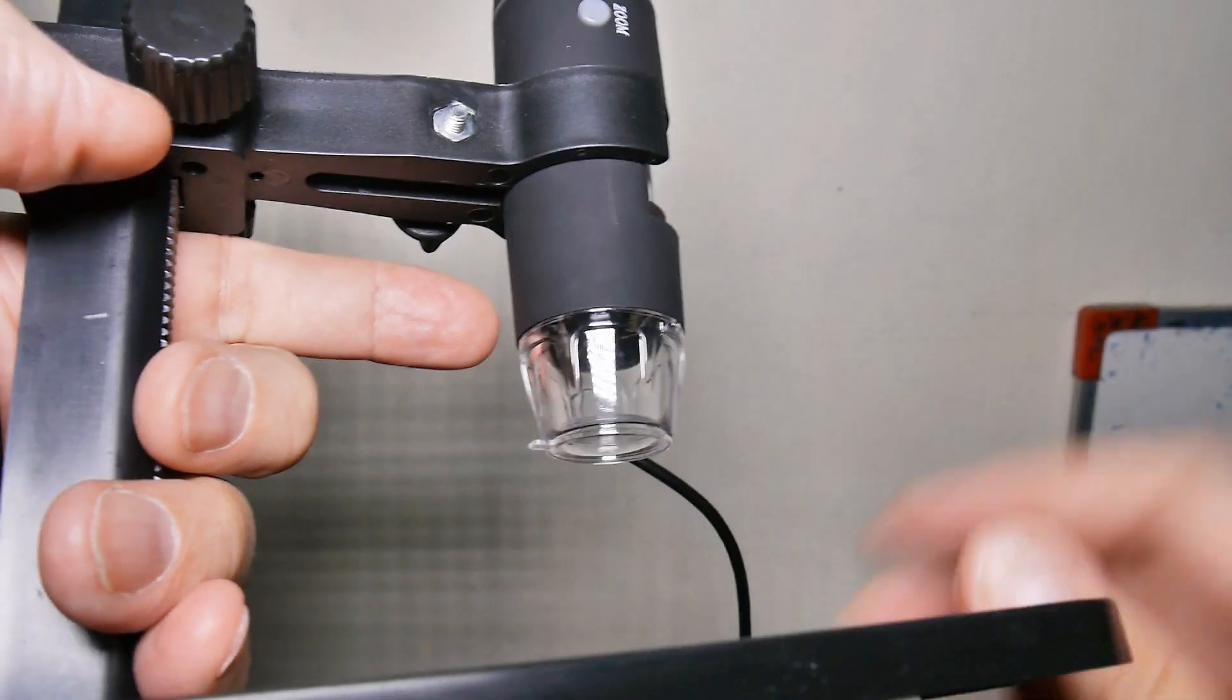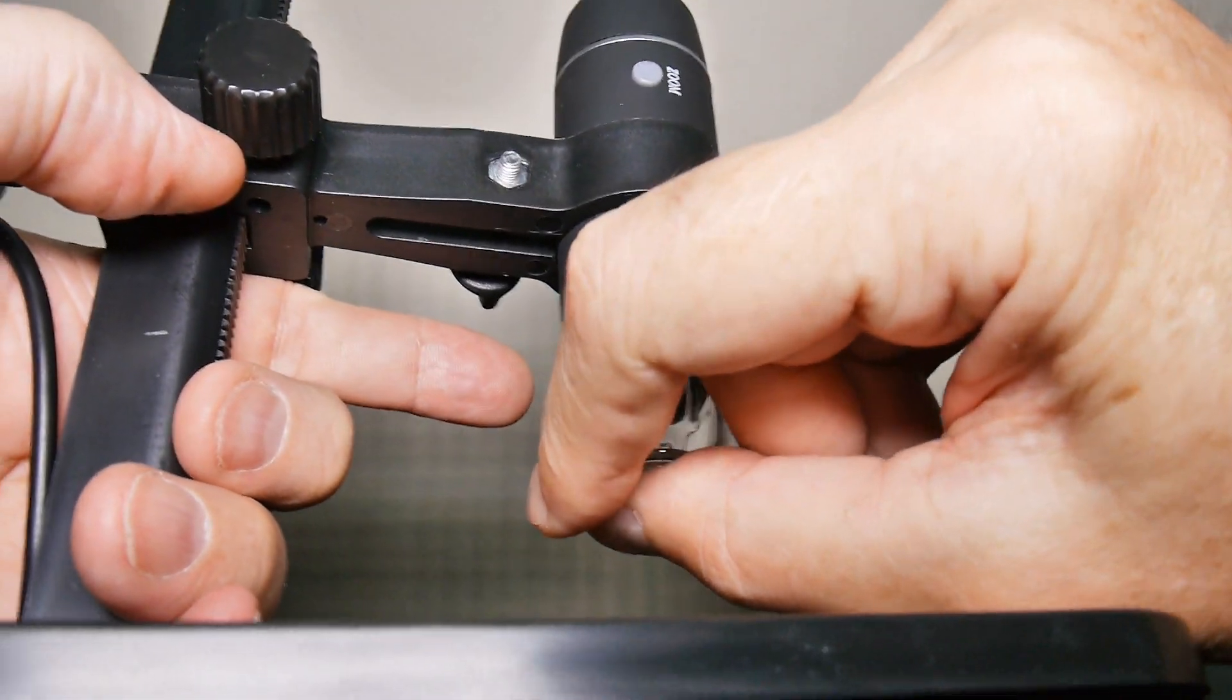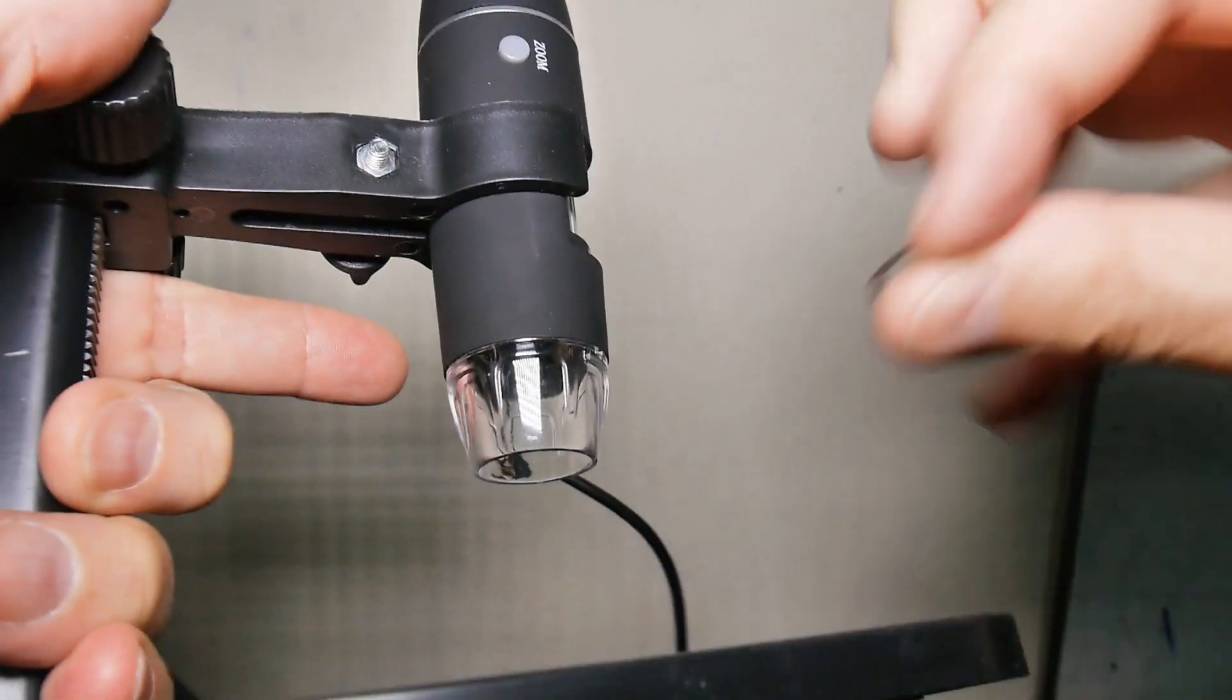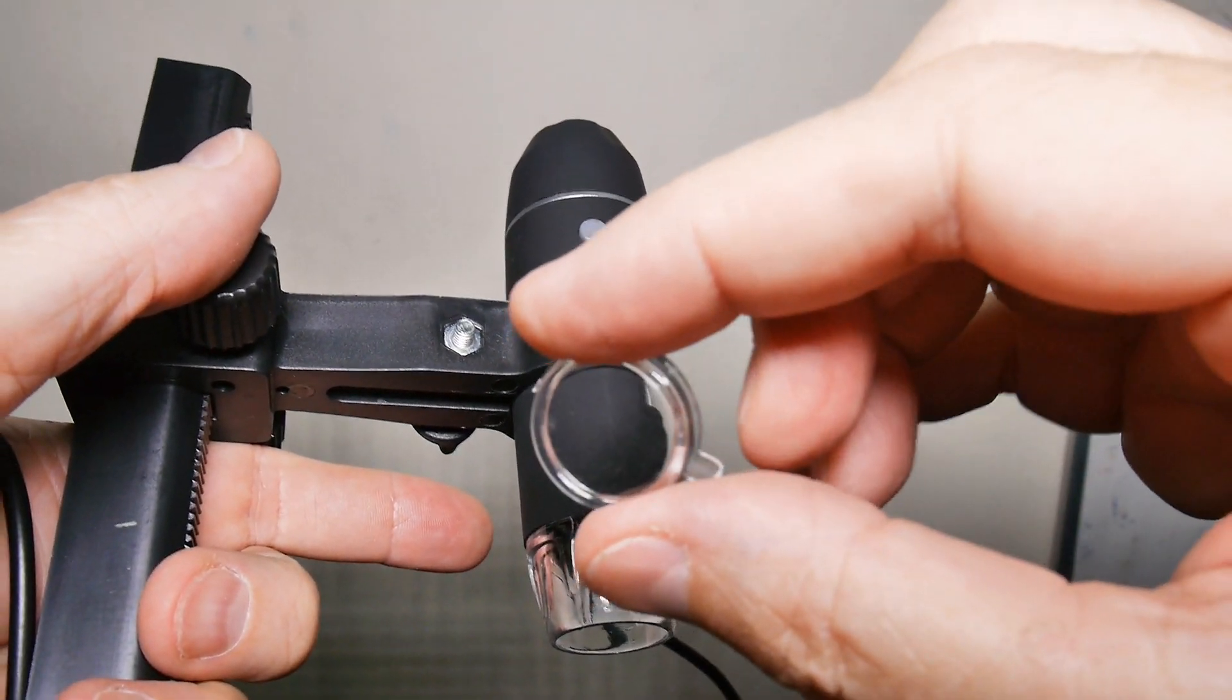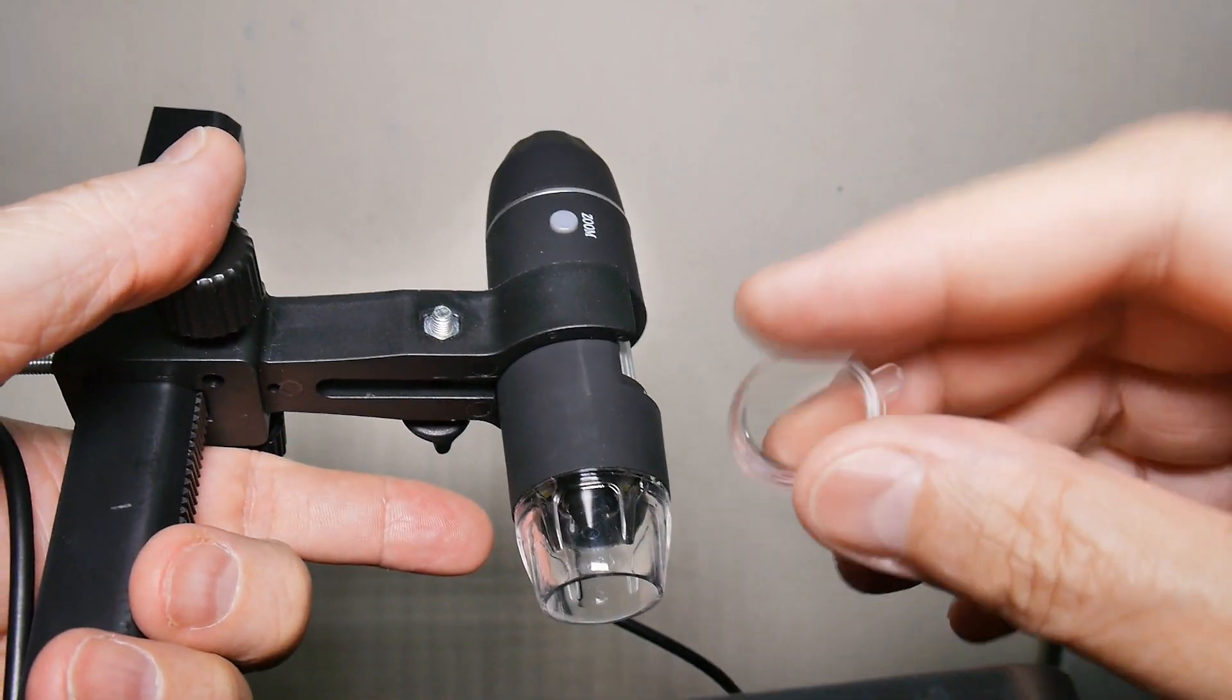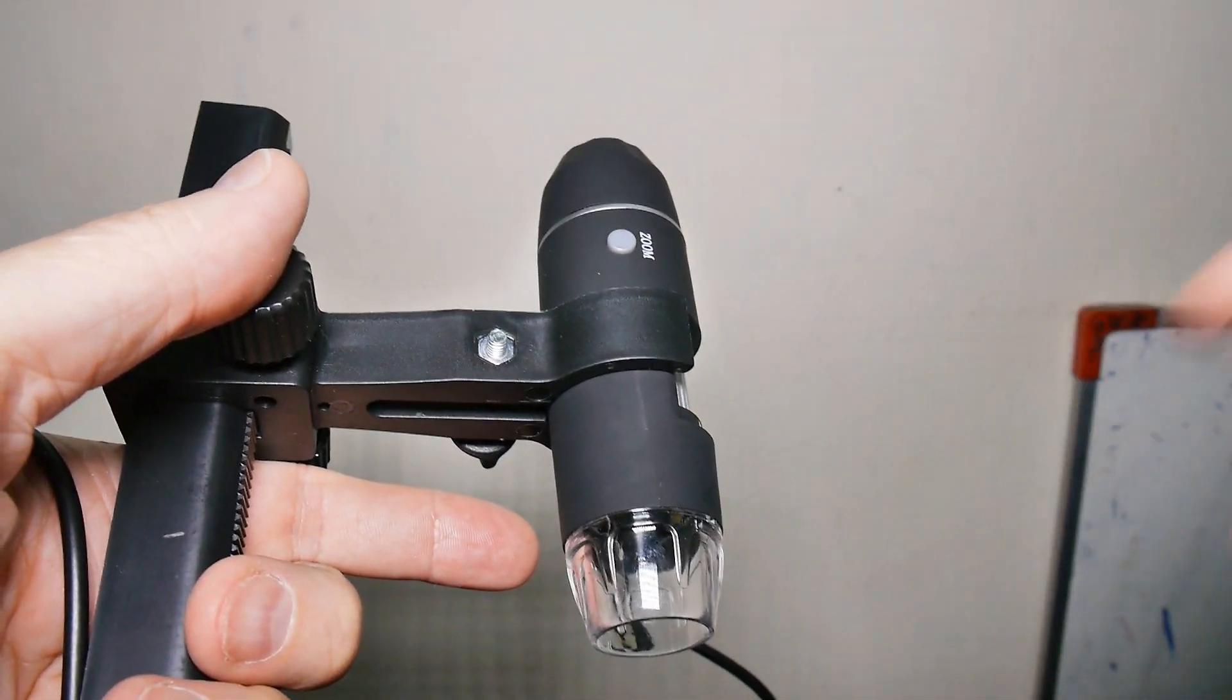Something I almost forgot to mention - it comes with a lens cap. You see this tab right here, and you pop that off. Otherwise your images aren't very good. It's not crystal clear, but okay, that was one thing I almost missed.